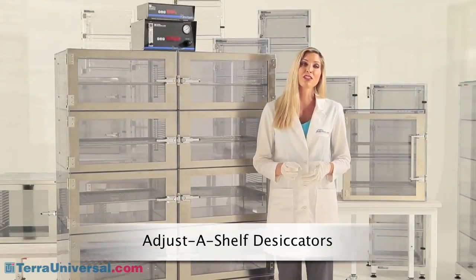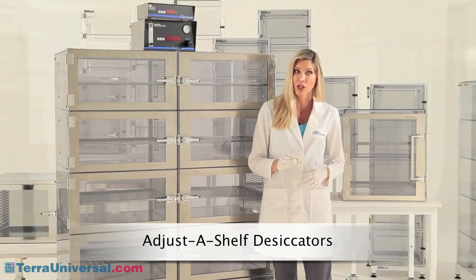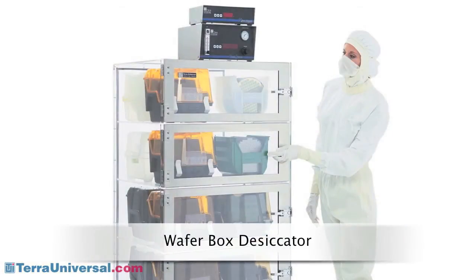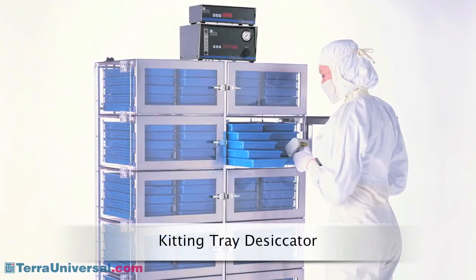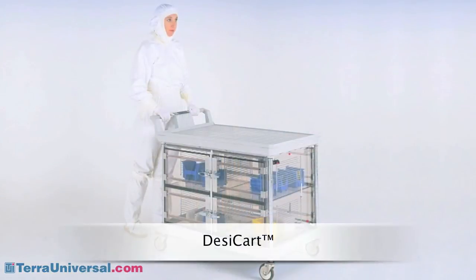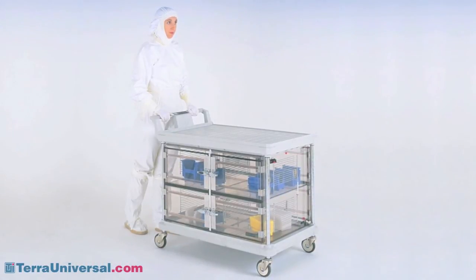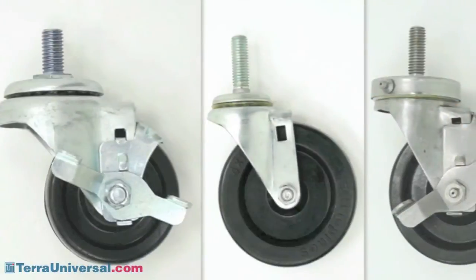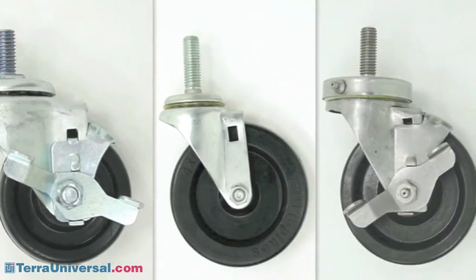Adjust-a-shelf desiccators come in many chamber sizes and configurations. Benchtop models include from one to six chambers, and floor-mount units have from four to ten chambers. Terra offers other plastic models specially sized to optimize access to particular parts like wafer boats, kitting trays, or semiconductor storage reels. Desiccator carts provide dry conditions during parts transfer — visit TerraUniversal.com for more information. Stands are available in powder-coated or stainless steel, with a number of caster options including all stainless steel models for contamination- and corrosion-sensitive environments.